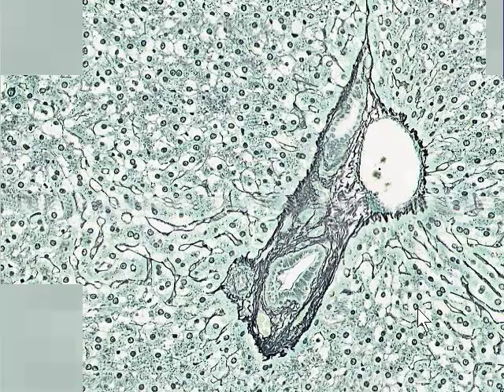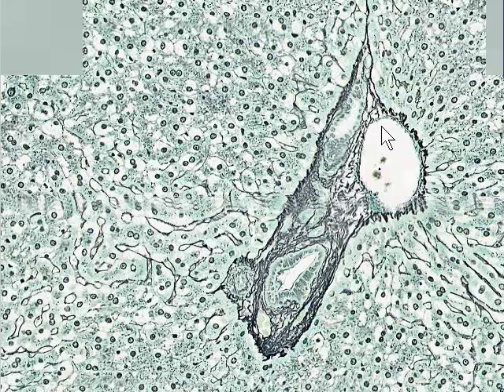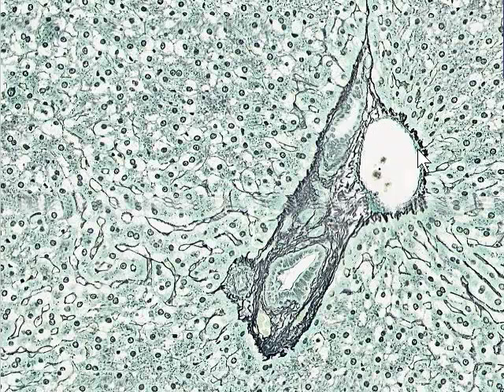So if we look at a little higher magnification again, let's take a look at the portal triad which we have in this region here. So here we have a portal venule, a large structure, very little wall structure to it at all. Here we've got some bile ductule here. In fact, we have two parts of the bile ductule, so we've cut it just past a fork. This region here is bile ductule, and this is bile ductule, and then closely associated with the bile ductule is some hepatic arteriole, and some of the other spaces here are lymphatic vessels.